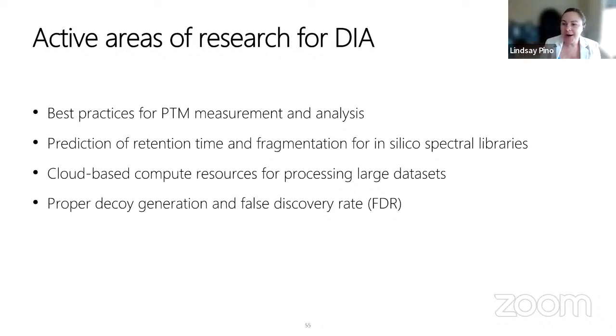As data sets get bigger, your computer might not be able to process them. You might run into this tomorrow or Wednesday if you're operating on a laptop, for example. So people are working on cloud-based resources so that we can process larger data sets.